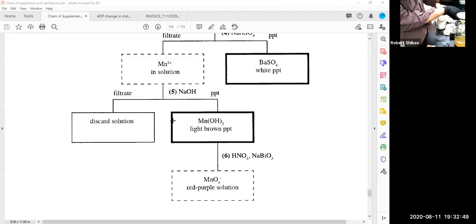And so let me set this on a ring. Clamp it to the ring stand. This ring is extremely hot. I can still feel the heat radiating off of it.